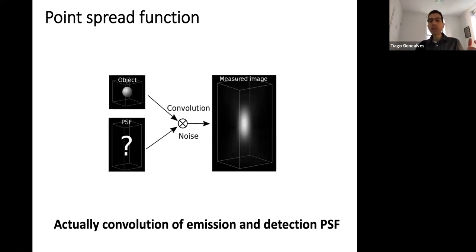Empirically, what they found is that if you make full use of the angular exit from the objective, the aperture of your imaging system after the objective, then you'll get better results in terms of resolution than with an objective that has a more limited angular aperture at the back end of the objective.